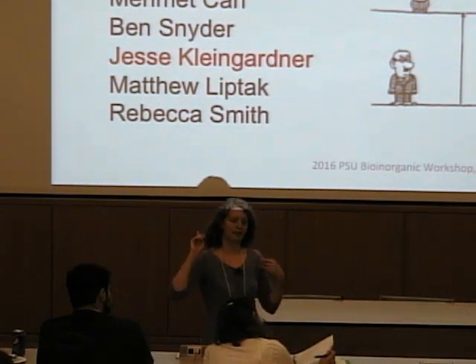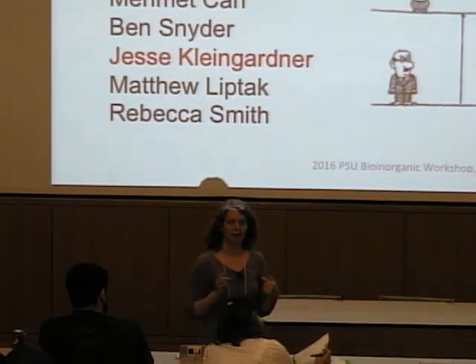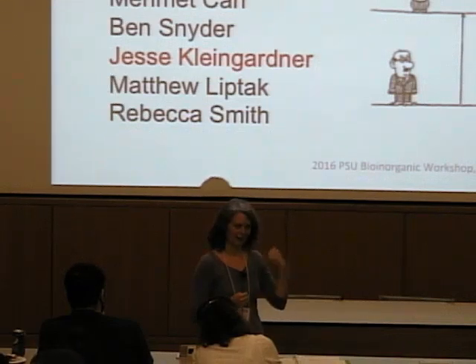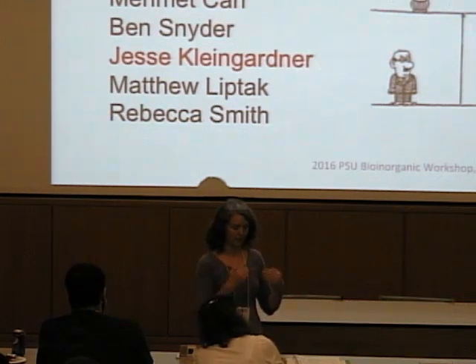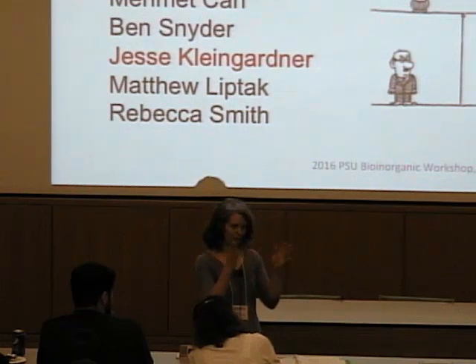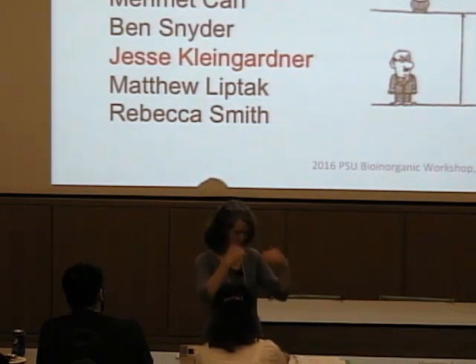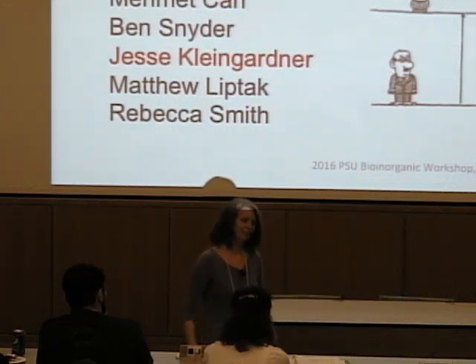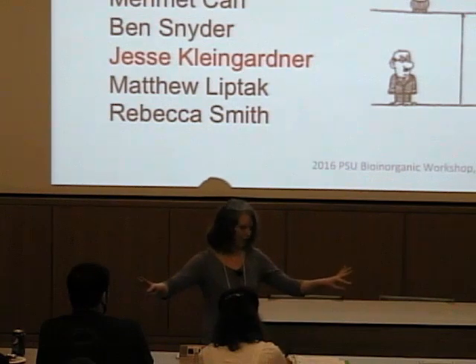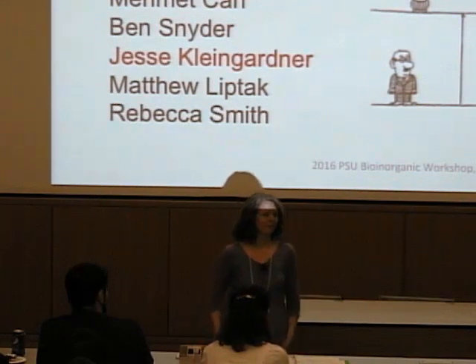Yeah, so the case that I showed you there, I couldn't find a good example of the temperature-dependent line widths. All the cases that I had had some sort of weird thing about them. So I just showed that example, which has an exchange process. That was actually going from intermediate exchange to fast exchange. Okay. And so that was the coalescence that we saw at the top. And the broad one was the, yeah. Okay, so if you kept going lower. If you kept going lower, then that would get broader and eventually go into two different forms. Okay. Yeah.